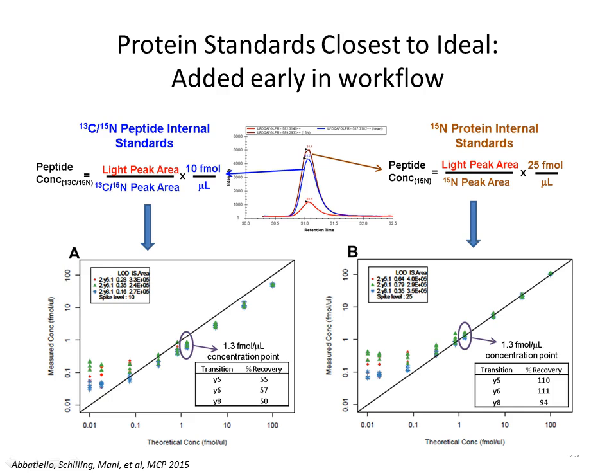It's not fun though, let me tell you. And I exploded an acetonitrile bottle there too because I put a waste bottle next to a vacuum thing. And health and safety was called. It was my 3rd week on the job. I thought I was getting fired. Good times.